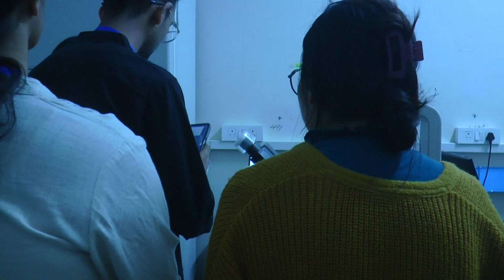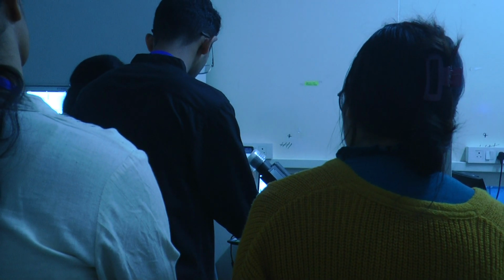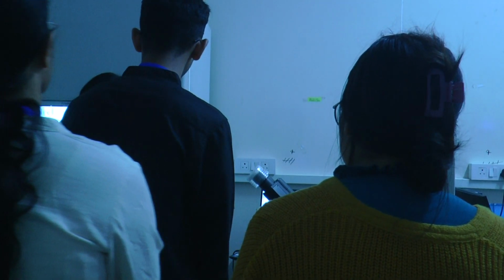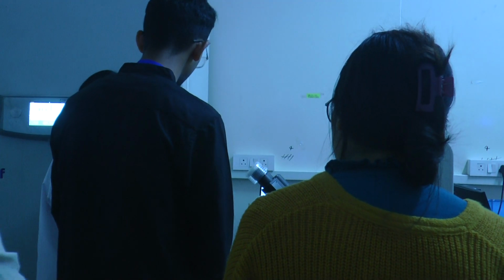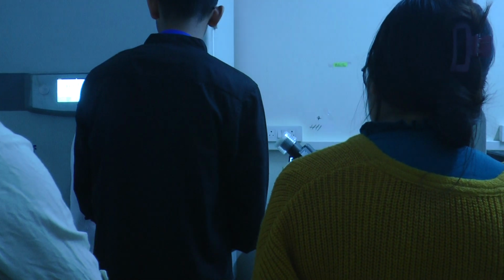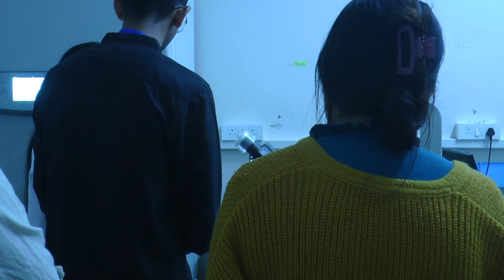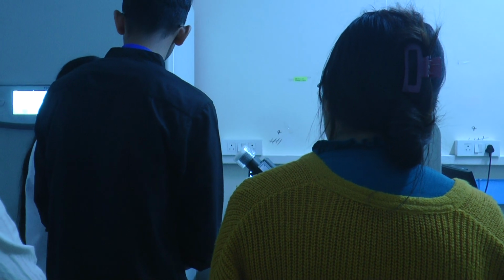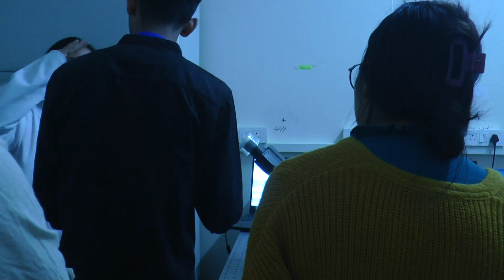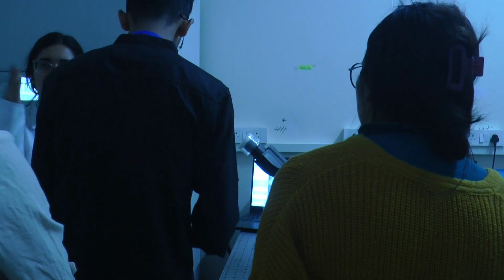See, this image is basically just a visualization of what you have prepared. If you take the image of an individual one, which I have got, you can measure its area and diameter, and you can also do confocal. I have taken a Z scan of that so I could see the shape. With the Z scan, it takes slices at the interval I have set, 0.5 micron. After every 0.5 micron interval, it takes a slice and then forms the image. With that I calculate the volumes.